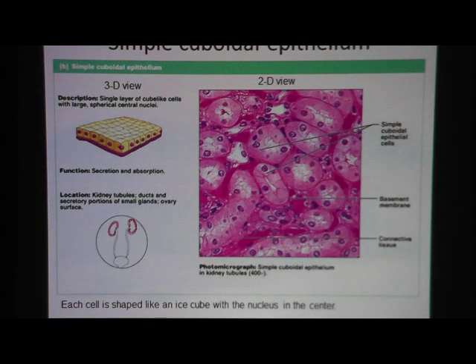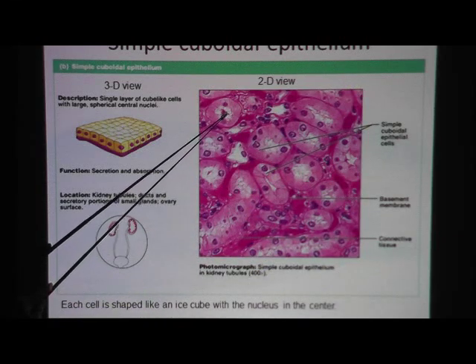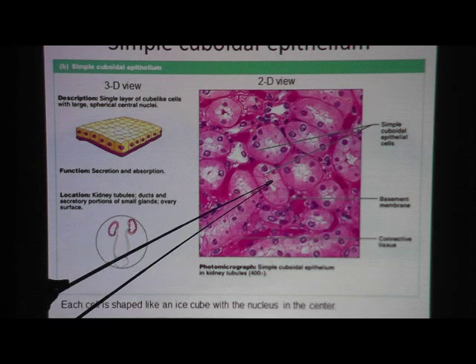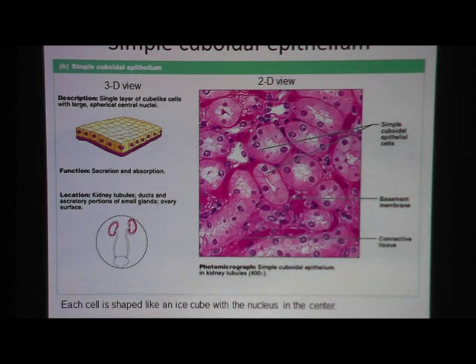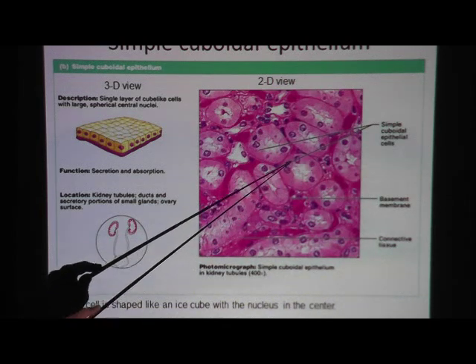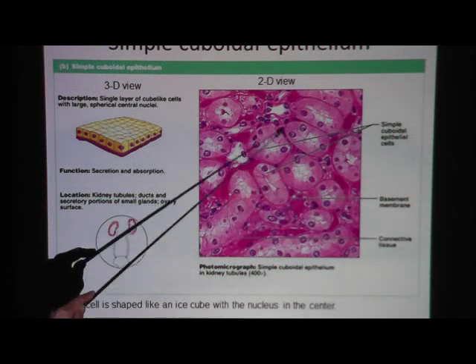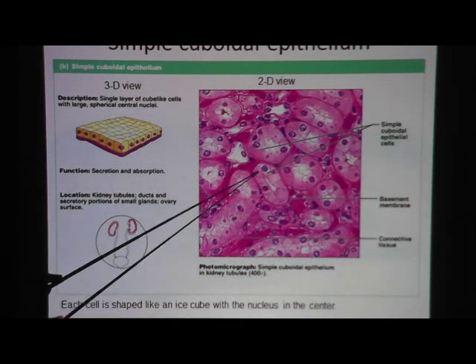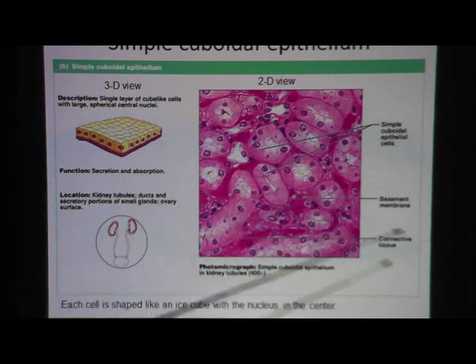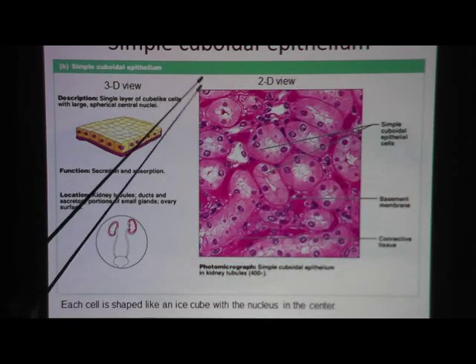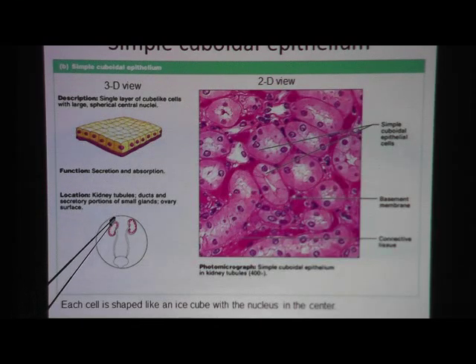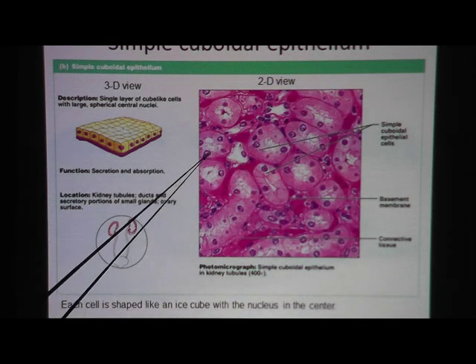Here's a typical textbook picture of simple cuboidal epithelium. You should see white spaces, which gives a hint that there is an opening — a space indicating this layer of cells is lining a round structure. All of these are tubules. The location of simple cuboidal epithelium is kidney tubules, and you can see the nucleus pretty clearly.